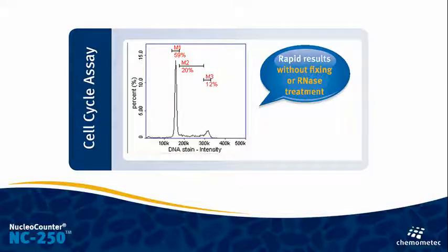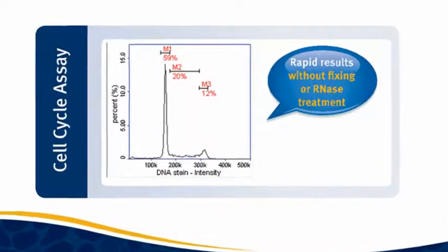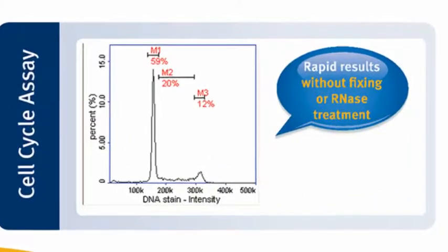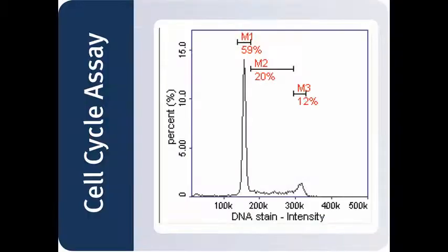In addition, the Nuclear Counter NC250 provides fast and easy assaying of cell cycle profiles with world-class precision. All you need to do is incubate your cells for 5 minutes with a mixture of lysis buffer and staining solution, followed by the addition of neutralization buffer, then load a slide and press run. The results show a histogram of the DNA stain intensity, and the G1, G0, S, and G2M phase populations can be measured by placing markers on the histogram.